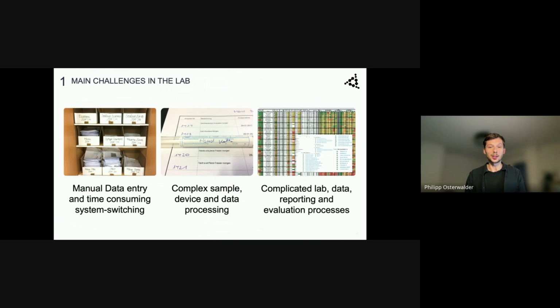And my lovely question: where can I find this specific result of this batch or lot number of this article or product? So there are a bunch of questions.